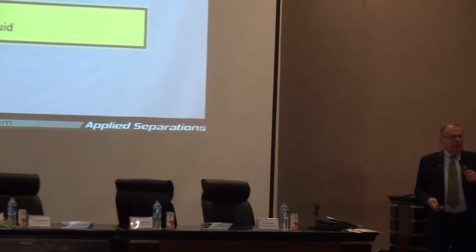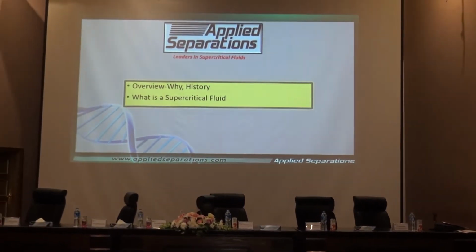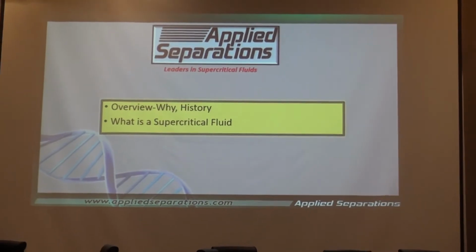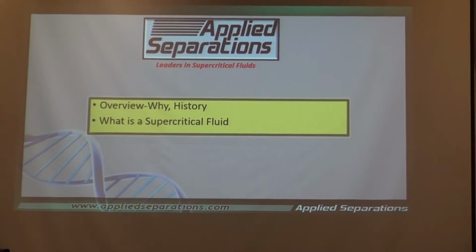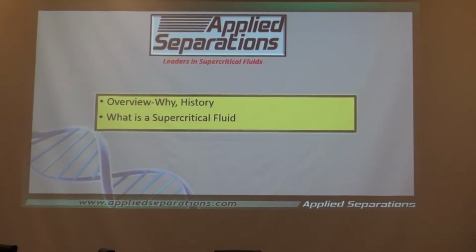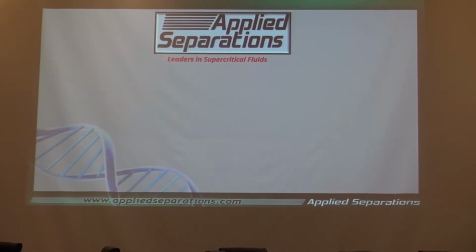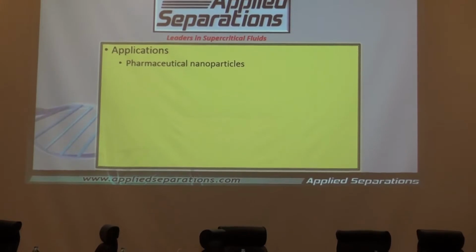What I'd like to do is talk a little bit about an overview of what supercritical fluids are, a little bit about the history, where we use them, and some of the examples that I will be using. These are all from applied separations. There are many, many different kinds of applications, and I would like to give you an overview of many different ways that one can use supercritical fluids. After that, we'll have a little bit of a break, and then I'll talk about the various applications. I will be very quick.